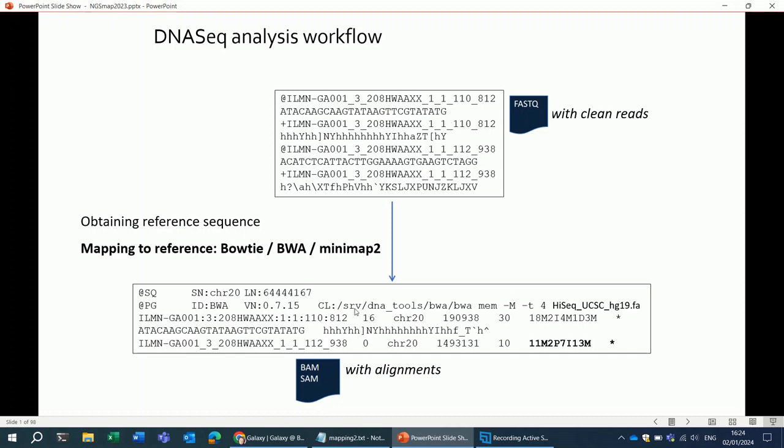That is what you see here: the location of the alignment, quality score for the alignment that expresses whether this read was mapped to one single location in the genome or whether it was mapped to multiple locations, and then a representation of the alignment itself. So that's this thing here. It's called the CIGAR string, and on the e-learning system you can find more information about these CIGAR strings.